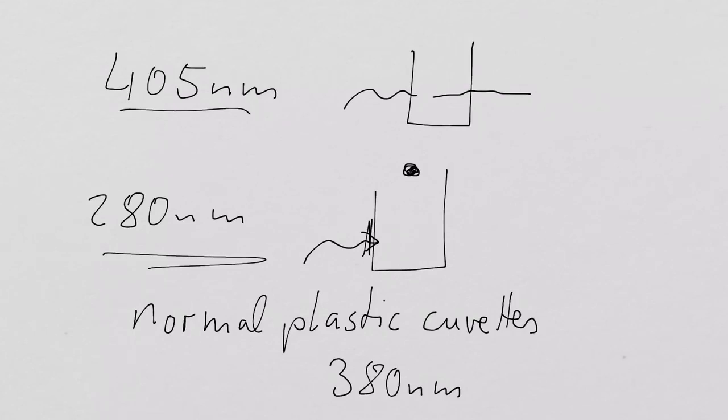You block out the UV light through the glass. If you had windows made of quartz, which would be fairly expensive, I can tell you, you could get a suntan. My advice would be, if you're really interested in a suntan and don't care about skin cancer, just go outside and grill there, and you save the costs for a quartz window. Okay? Does that make sense, what I described?